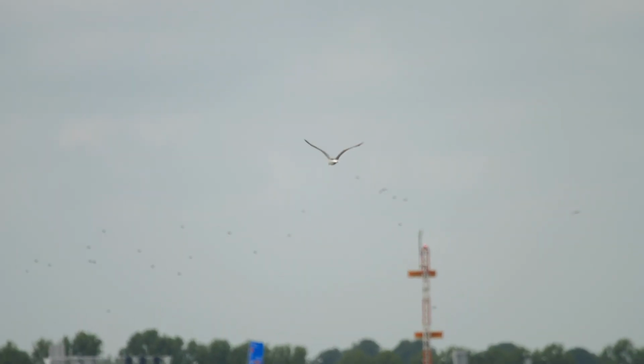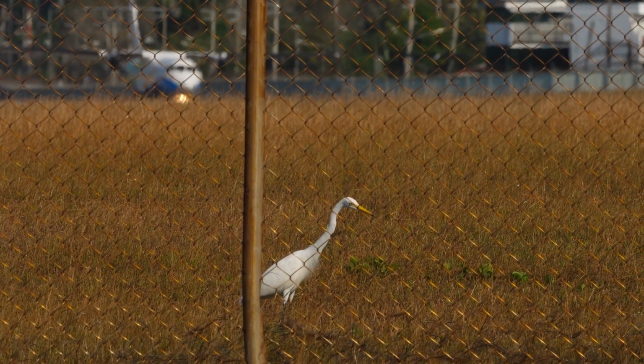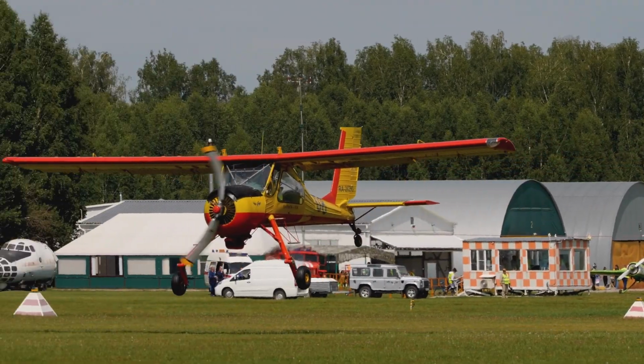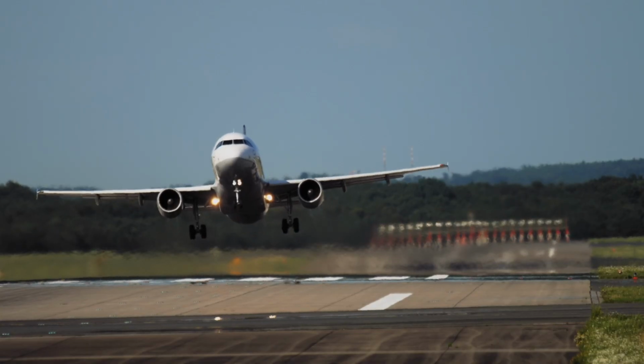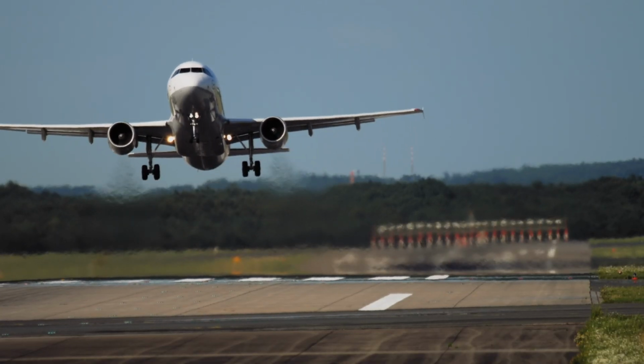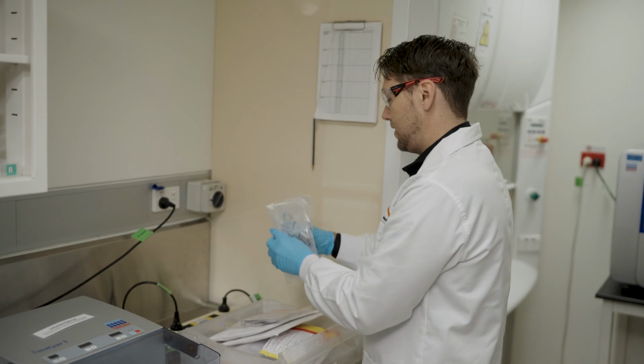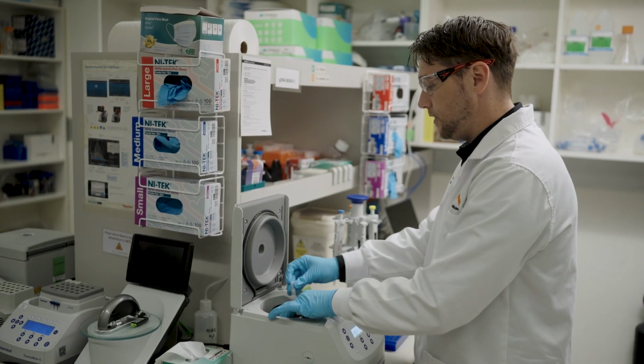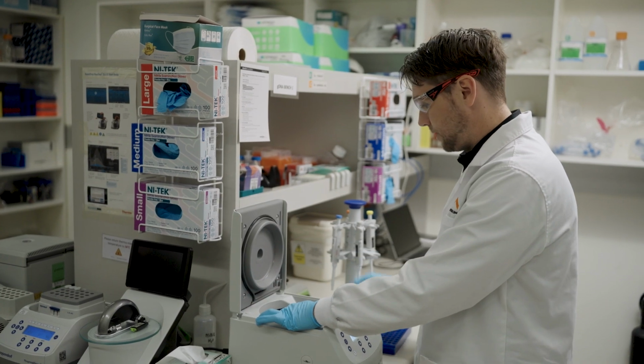Airstrike is basically an event where wildlife, whether it's a bird, a bat, even ground-dwelling organisms occasionally, come into contact with a plane. It can cost lives in extreme cases and is also very expensive to aerodrome and aircraft operators. So we work very closely here at the Australian Museum with the aviation industry, where different types of airports will send samples across to us, and we then perform genetic analyses on those samples to determine what species are actually involved in an aviation airstrike.